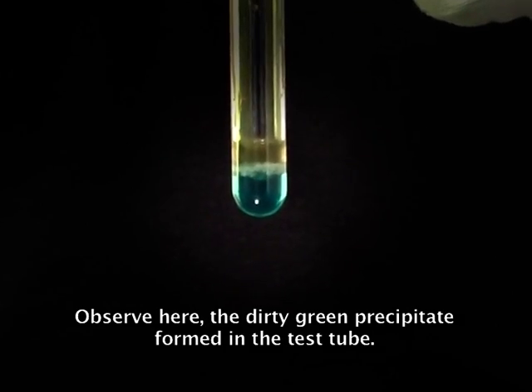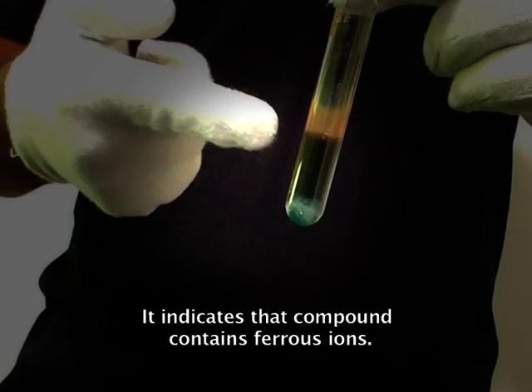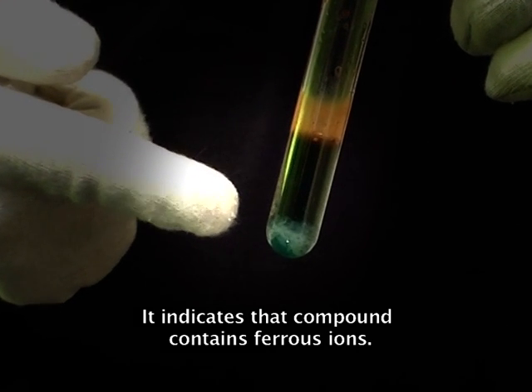Observe here — the dirty green precipitate formed in the test tube. It indicates that the compound contains ferrous ions.